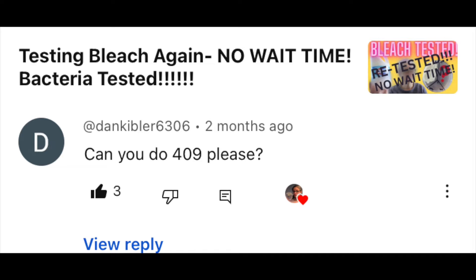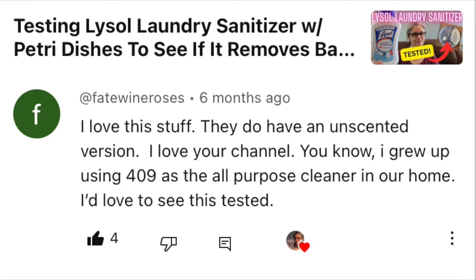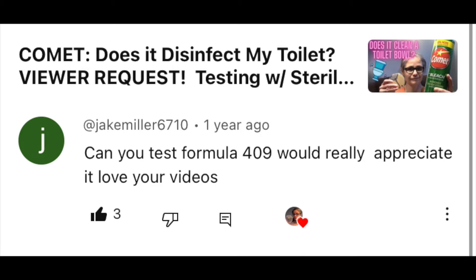Hi everybody. Today's focus: I am testing Formula 409 to see how well it removes bacteria from my home. Today's video is a viewer request. I received requests to test 409 from Dan Kibler, Fate Wine Roses, and Jake Miller. So 409 is one of those cleaners that my mom always had around when I was growing up, so I'm also curious to see how well it removes bacteria.